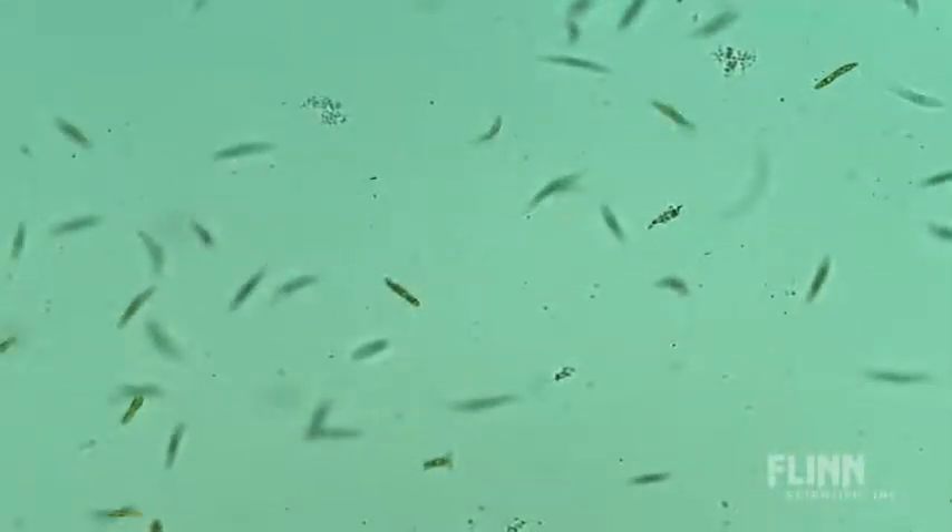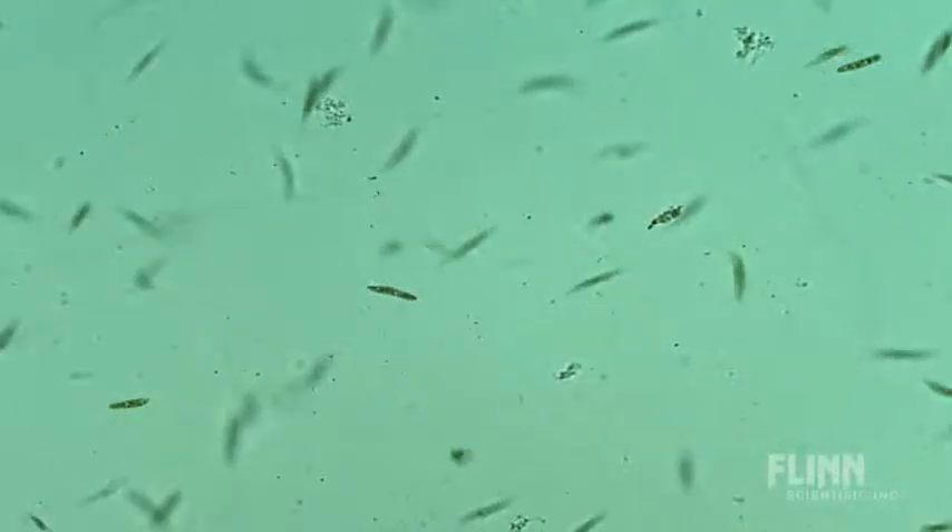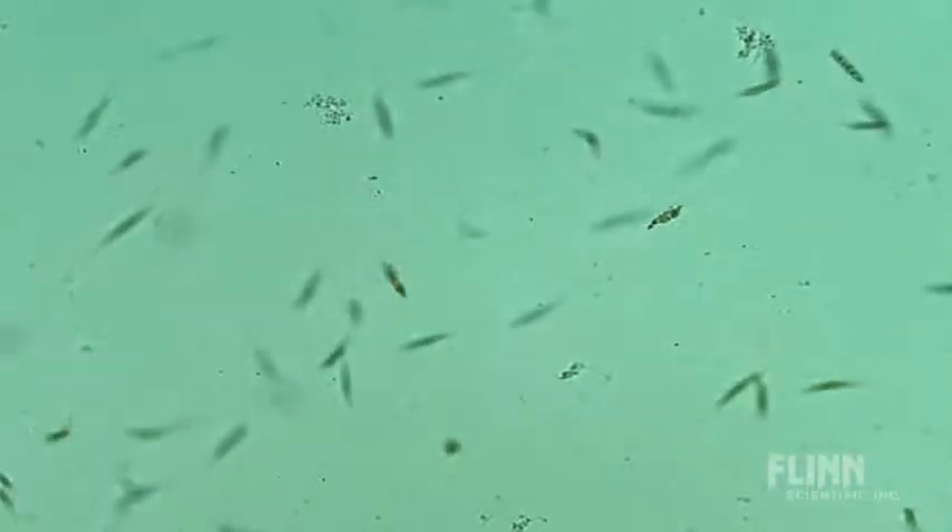Students should be able to see the flagella, should be able to see the internal organs, and they should be able to see that the euglena are green in color. Euglena are found everywhere on earth and they are one of the most interesting microorganisms that you will use in your classroom.